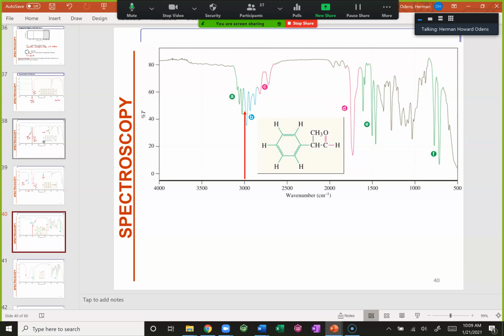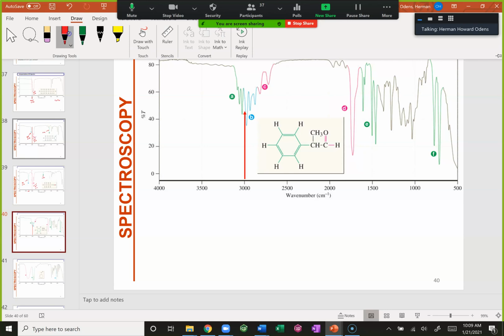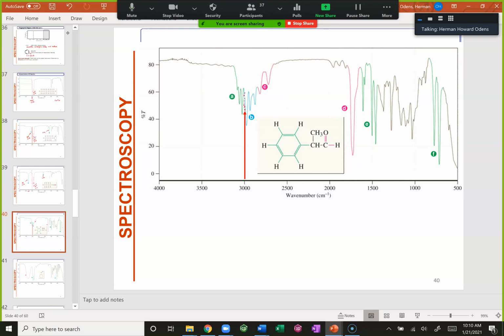All right. So check this molecule out. We have aromatic peaks. We have aliphatic carbons, and we have an aldehyde. So we're gonna be busy right here. All right, check it out. So here we're gonna trace a line at the 3000, the magic line. Always split it, and what I do is I'll just continue it all the way up.